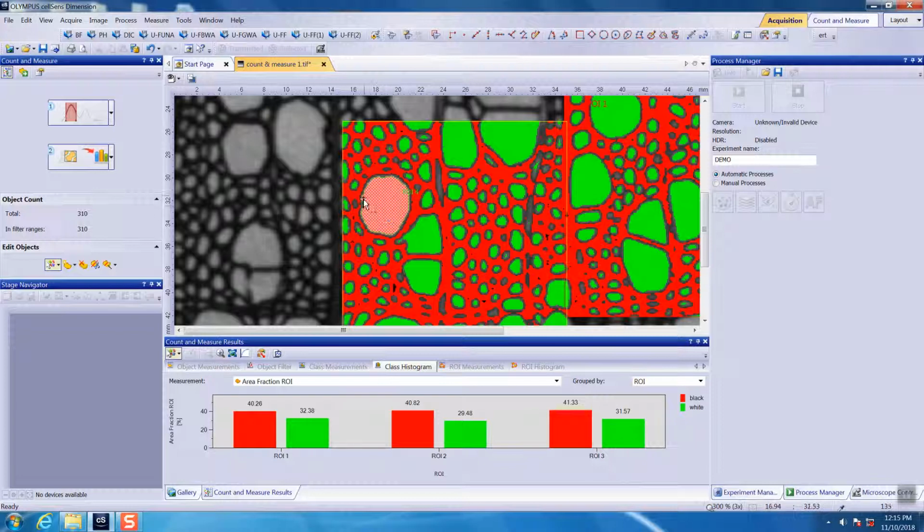For example, this is a cell. I want to count how many of the labeling or shining spots I labeled in this cell. This would be very useful. You choose this as ROI. So later on, when you do measurement, you can take each of the ROI as one cell to count the things you are interested in.